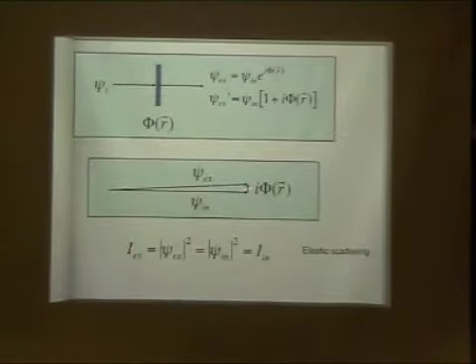The only thing that changes is the phase shift. So you can describe the incoming beam and the exit beam with an additional phase. This phase carries the information from your specimen. Now, in the weak phase approximation, which Bob and Dylan both mentioned, after approximation you can make them look like this.